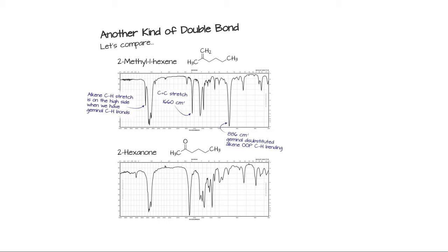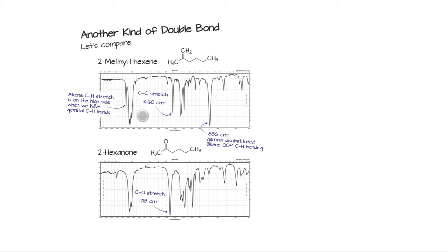So, as we might expect, the carbon-carbon double bond has a frequency of around 1650, and there's the frequency that we see for this ketone, around 1715, exactly where we expect ketones to be. So, we should be able to easily spot carbonyls because that peak comes out basically in this quiet area here. It's going to come up right here and be hard to miss.